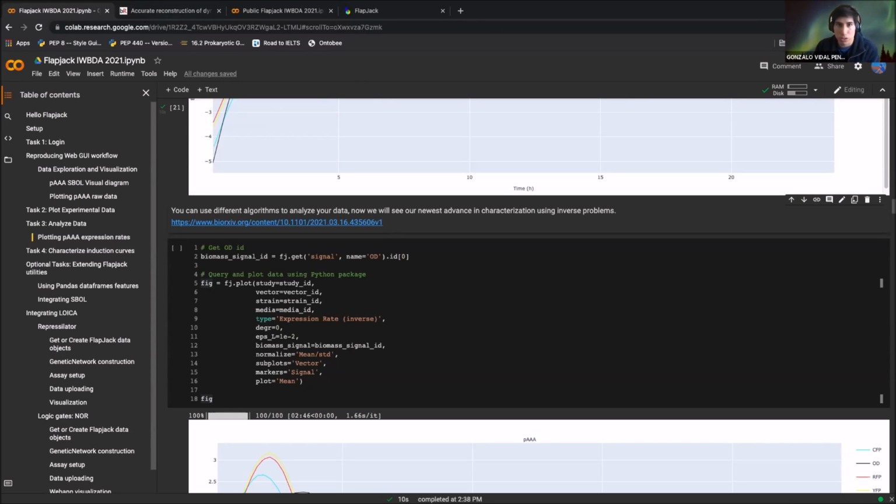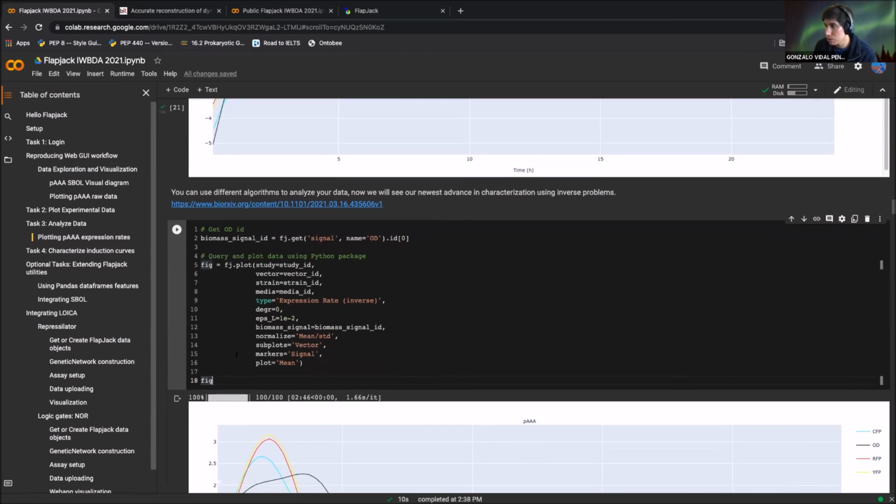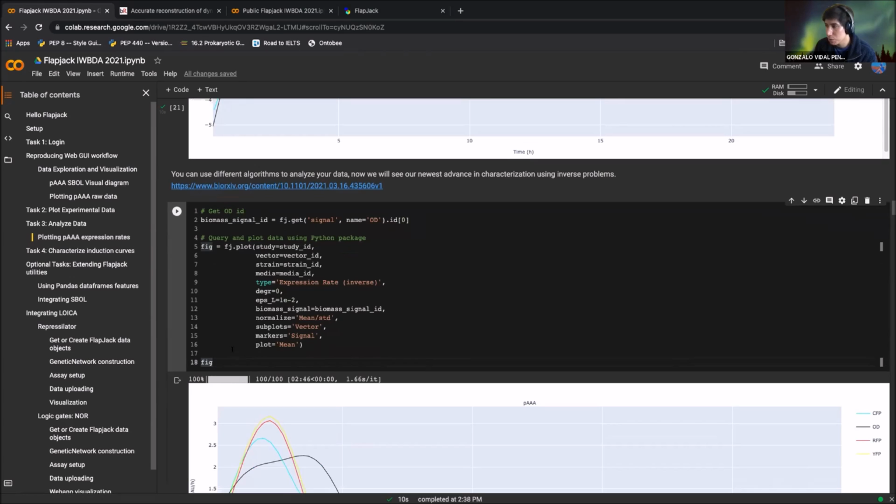Okay, questions from Alex Fedore. Currently, all of the data is in arbitrary units. Do you have a plan to implement calibration of OD and fluorescence to get cell particle counts and molecule counts? Yes, that's a really good question and a really neat thing in synthetic biology overall. This is done in arbitrary units because these are old experiments, but now we're working with the iGEM engineering committee in order to get the correct calibrants.